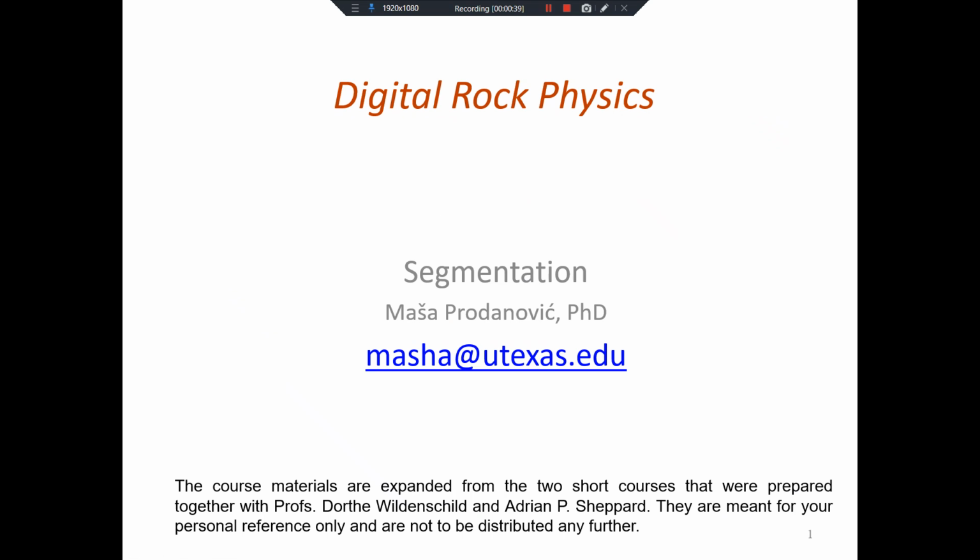So the phase can be described as materials or physical materials that have certain density. If two materials have density that is very similar, we will not see them on an X-ray image. So they might be physical phases that are different. It could be water and water with a polymer. Same thing as far as X-ray is concerned, because the density doesn't change enough to actually register. I need to have some contrast agent for that to be the case.